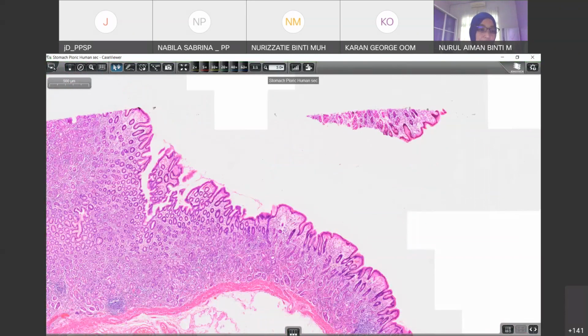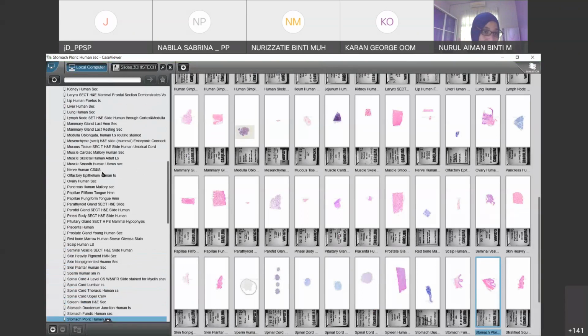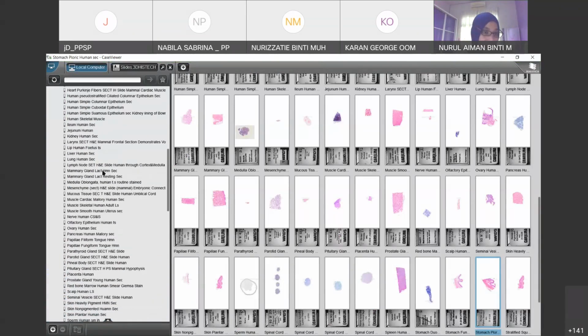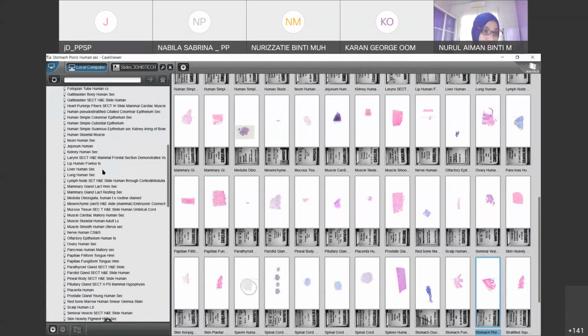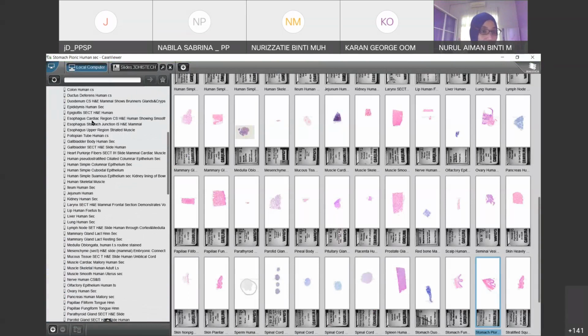What else that I missed? What else can we show to you? I think that's all. All the rest I have shown to you. What we can see clearly here are the stratified duct, columnar duct, cuboidal duct. I don't think there is anything else. Doctor, yes?